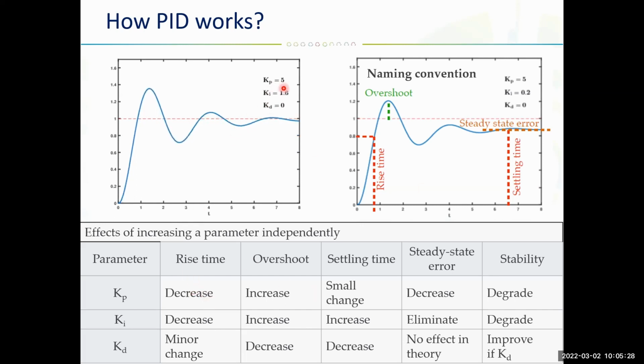For example, we set Ki and Kd to 0, and then we start with the Kp value and gradually increase it, and then we will have more oscillations happening. Once this is happening, we start to tune the next parameter to reduce all these oscillations. The thing is to try to reduce the overshoot. For example, this one is the overshoot, and that's when the system is not optimized correctly.